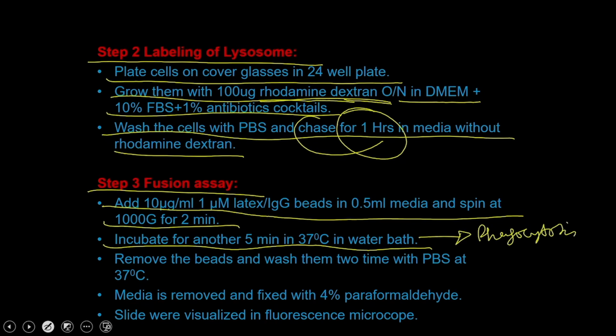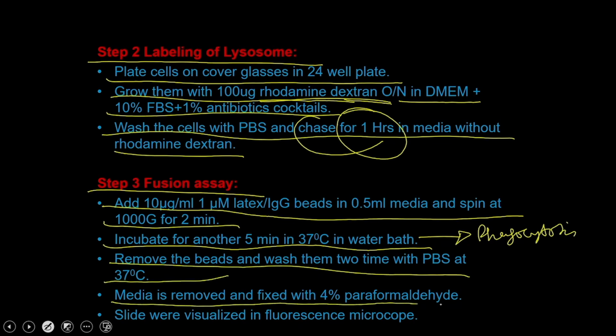And then you remove the beads and wash them twice with the PBS at 37 degrees Celsius. The media is removed and fixed with paraformaldehyde. Then your slides are visualized under the microscope.